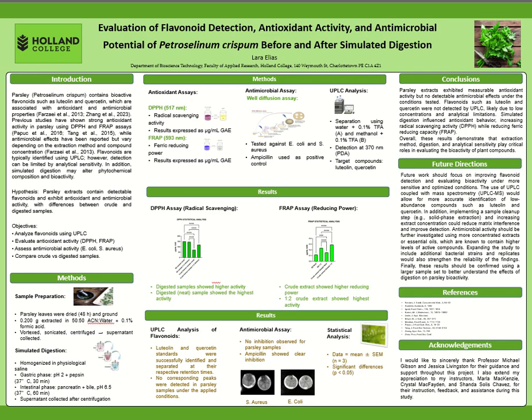Luteolin and quercetin standards were successfully identified and separated at their retention time. However, no corresponding peaks were detected in parsley samples, suggesting that flavonoid concentrations were likely below the detection limit.